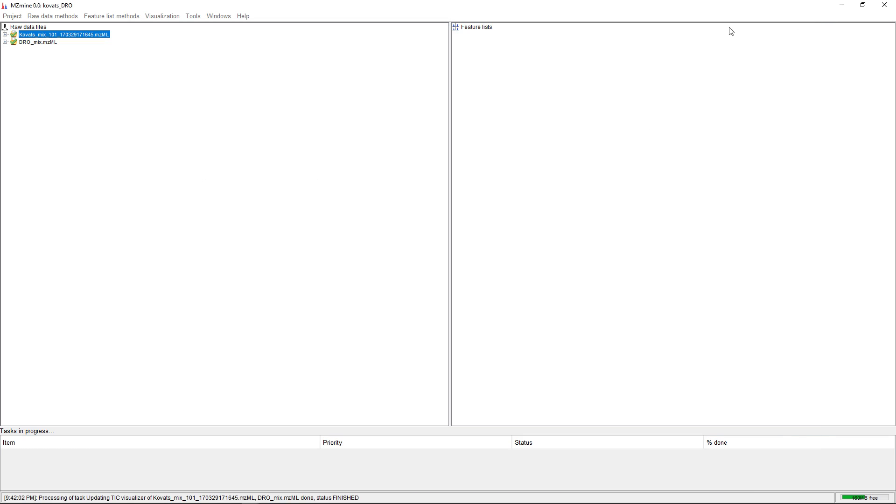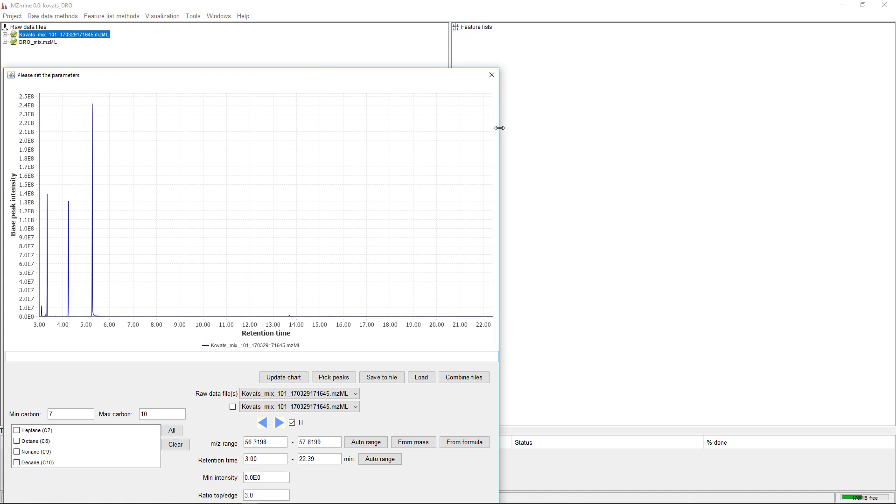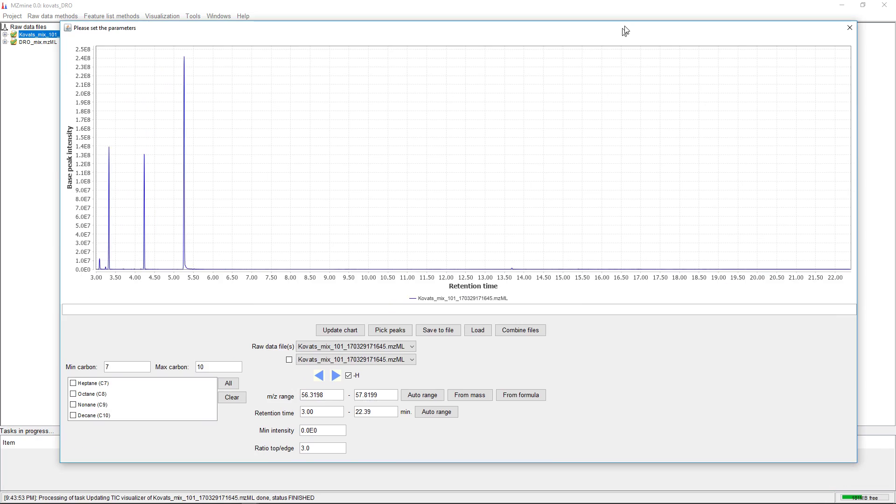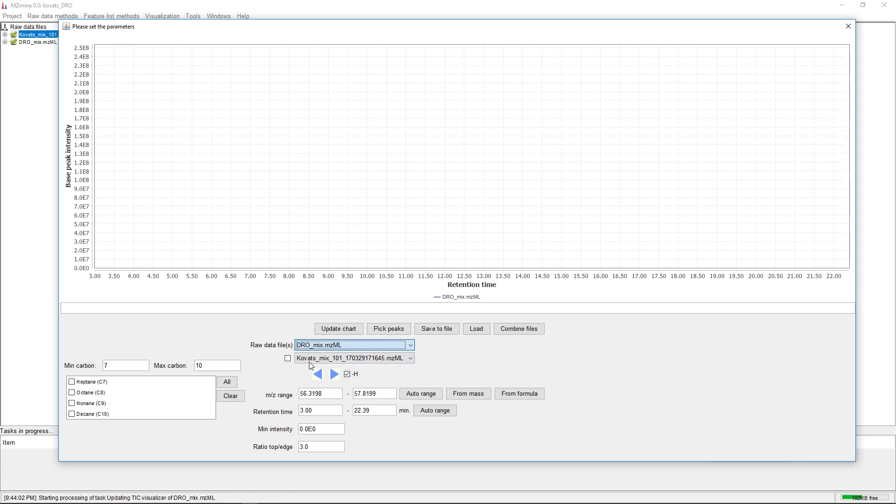To open this dialogue, we go to Tools, Kovacs index extraction. In this dialogue, we have the base peak plot on the top and can choose the sample.